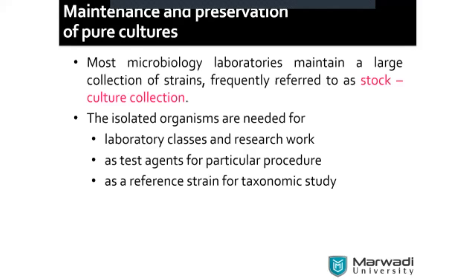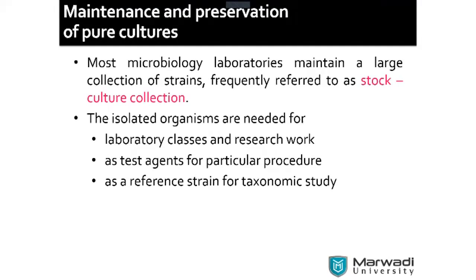Why do we go for any preservative methods? Some basic reasons: to do the same work continuously. Sometimes you are working and need the same culture, like E. coli, for basic experimentation in a general class. Or maybe you are working on some particular targeted work. Then it may be beneficial or harmful.